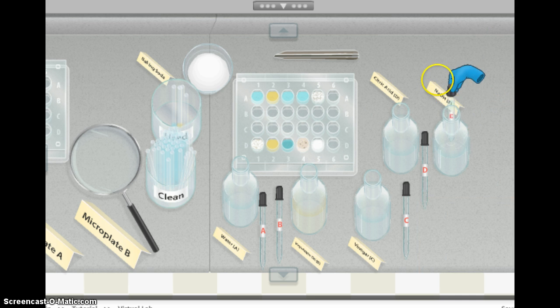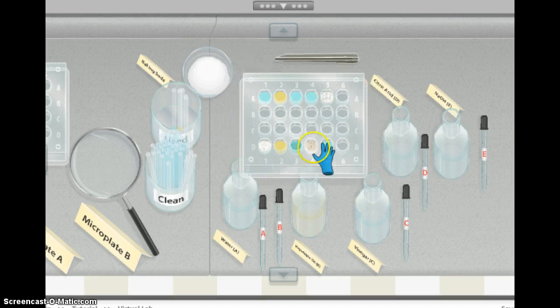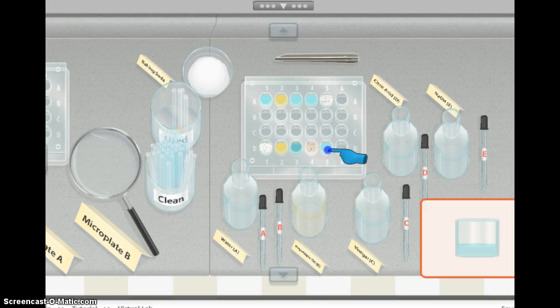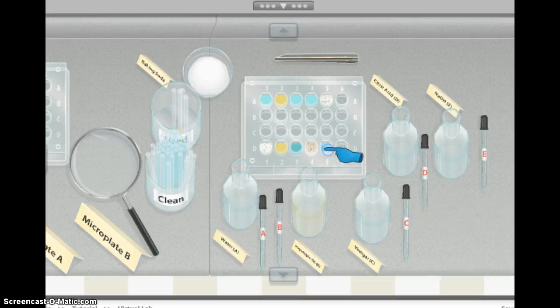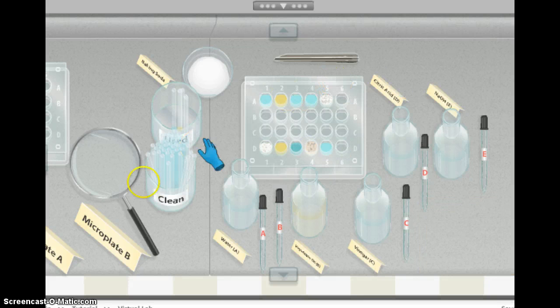And now we're going to do sodium hydroxide. Sodium hydroxide, anything that ends in OH or hydroxide is a base. Bases are opposites of acids. So do you think it's going to bubble? Oops, no. And there you go. That's our observations. So baking soda is a base. We put two bases together. This is what happens. We put a base and an acid together, and this is what should happen. All right, so make sure you got all your notes written down.